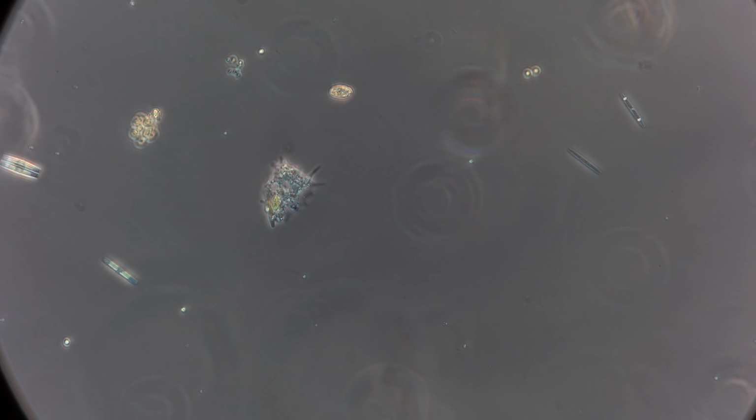Where it's like 15 different directions. Okay, let's go in this direction. Yeah, those are called pseudopods. Some little guys.